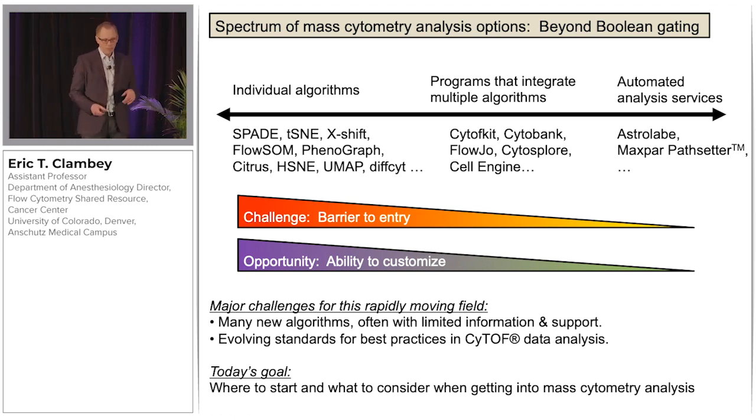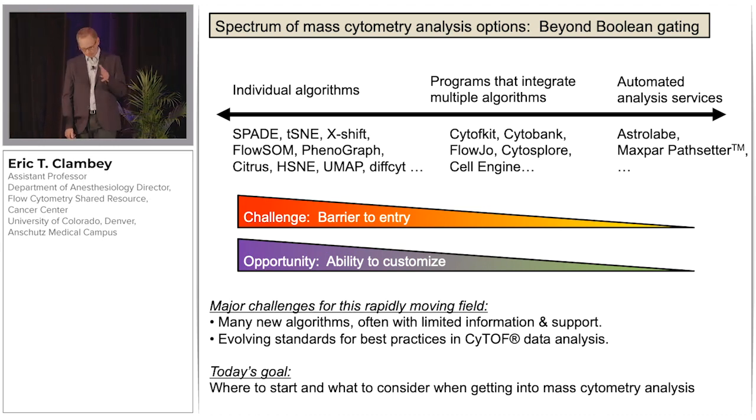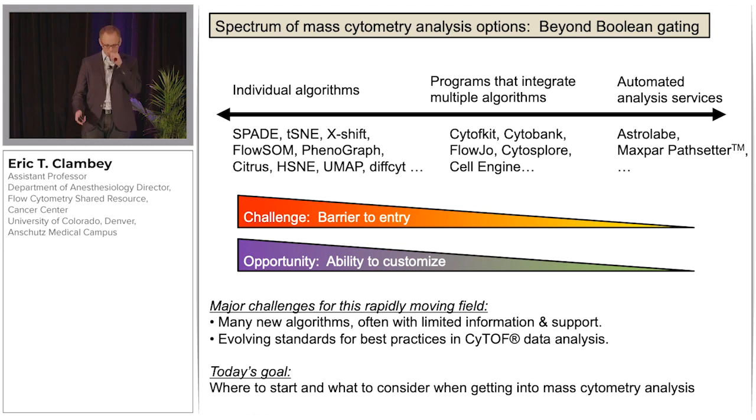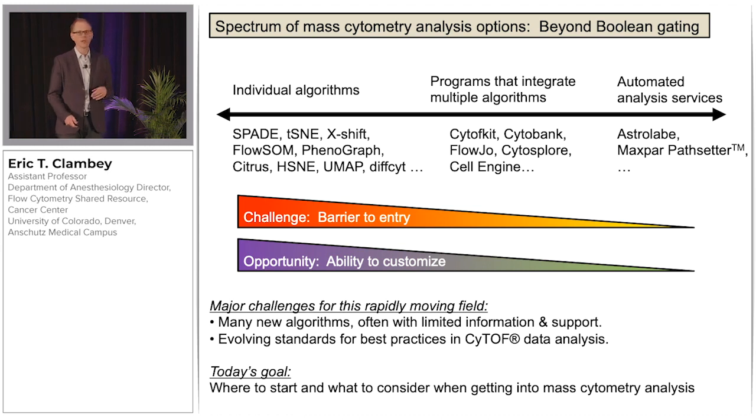It's also worth noting that this is a rapidly moving field. There are many new algorithms being developed, often with very limited information support for people who aren't in the lab that developed that algorithm, right? And so this is a big challenge. Yesterday alone, there were at least 12 different algorithms for data analysis presented, and there have been additional ones today. I would also argue that there are evolving standards for the best practices in CyTOF data analysis. And so now we'll talk about where to start and what to consider when getting into high-dimensional data analysis.